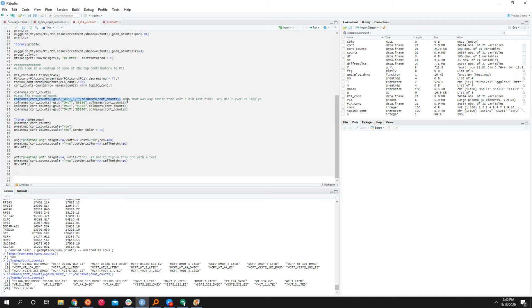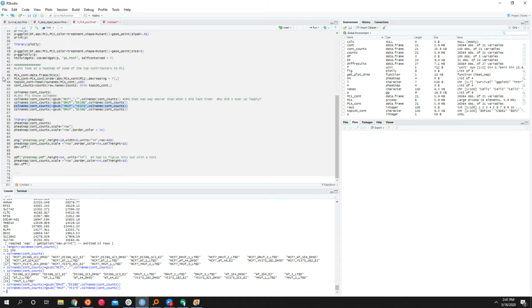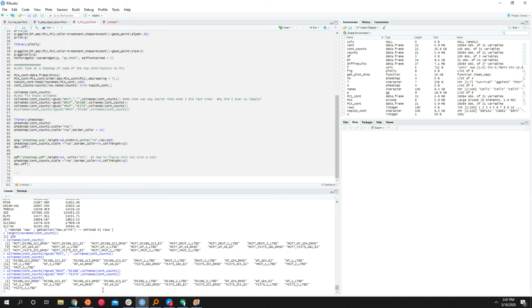And now we're also going to get rid of the demute and replace it with the correct mutant names, and the ymute, correct the mutant name there. This one I'm not using at the moment. All right, so now it's not perfect, but the names are at least somewhat consistent.